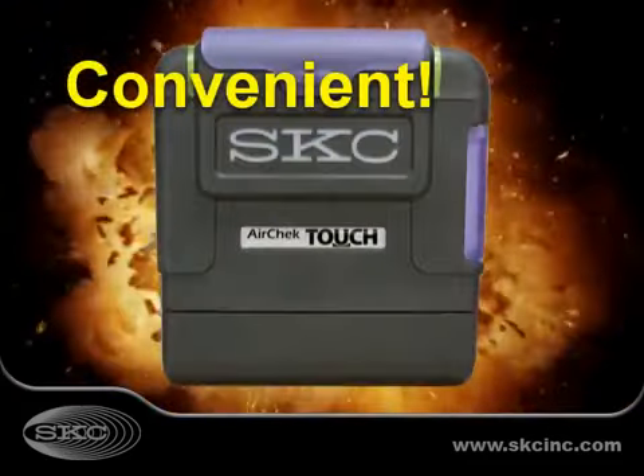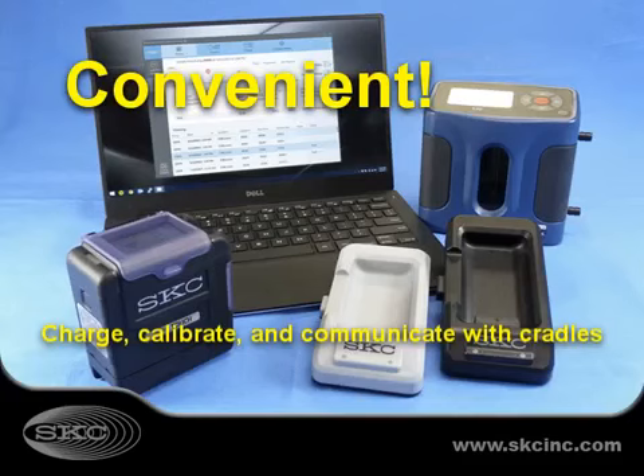The most user-friendly pump on the market, AirCheck Touch features charging, calibration, and communication with cradle.